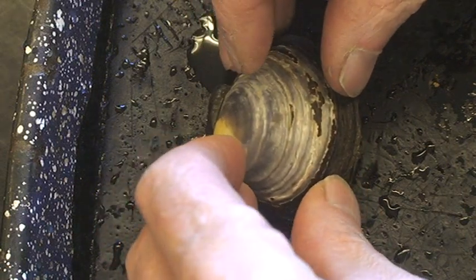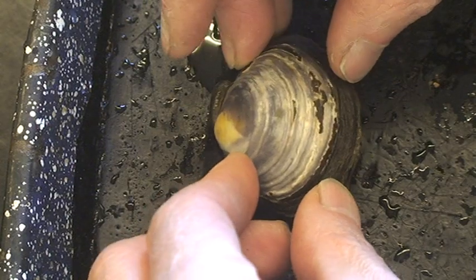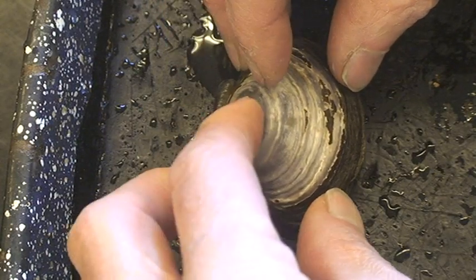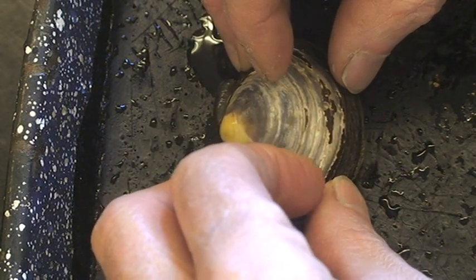I want to show you the dissection of a clam, what the body is like inside of a clam. Of course, this is a member of Phyla Mollusca, it's a mollusk, and this particular clam is one that is easily available from the grocery store.